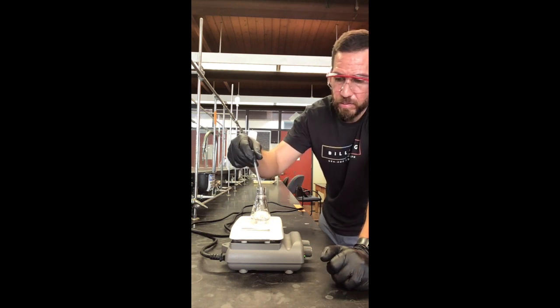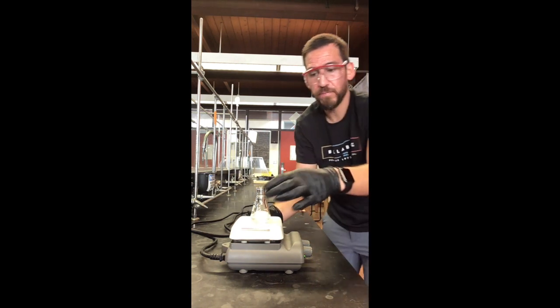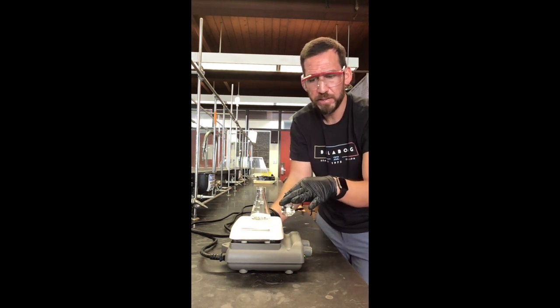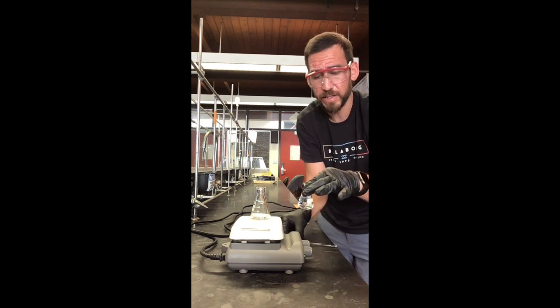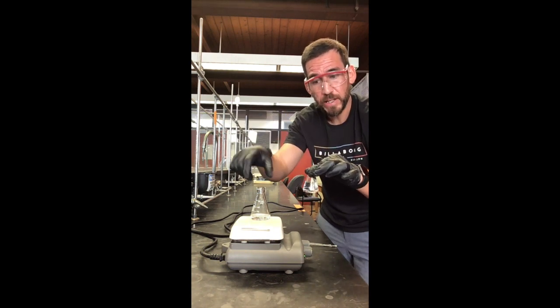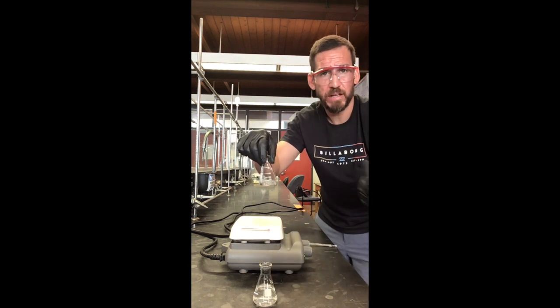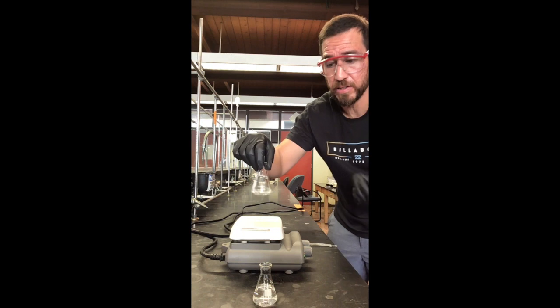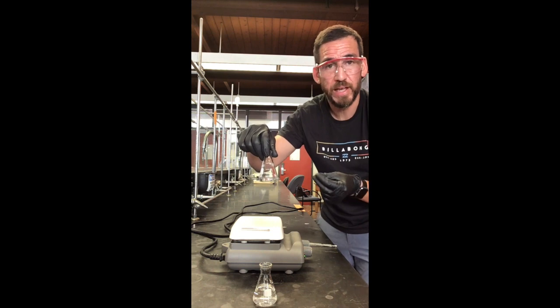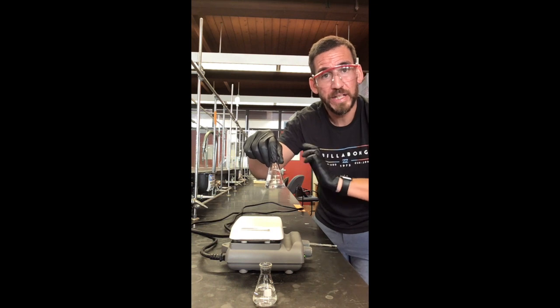So this is why I want you to get these medicine droppers. If I kind of observed and realized there's a lot of caffeine sample in here and I don't think any of that's going to dissolve, I would pipette carefully a little bit of ethanol into here. Using a pipette allows me to be more careful and add just the minimal amount, because again, we want only the minimal amount of ethanol to dissolve this caffeine, because that's going to almost ensure that we have a saturated solution of caffeine in hot ethanol.